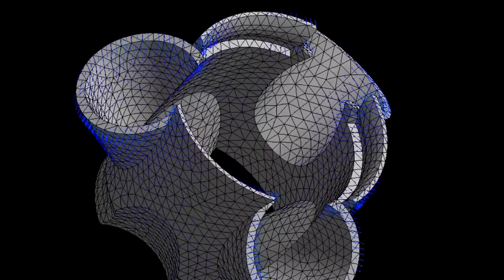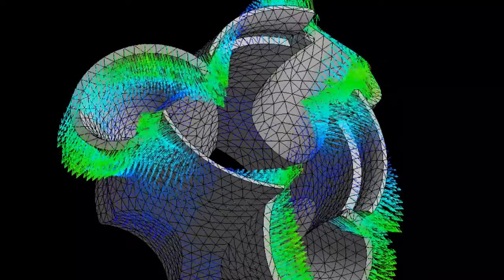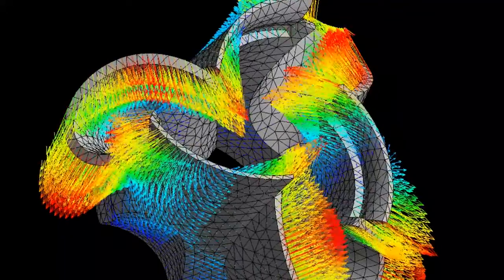This workshop is going to focus on dynamic mechanical analysis, DMA. We're going to evaluate how polymeric materials, with an emphasis on plastics, can be characterized using DMA to understand how the materials are temperature dependent, time dependent, and frequency dependent. Essentially, we're going to look at how DMA can assess the viscoelastic properties of polymeric materials.